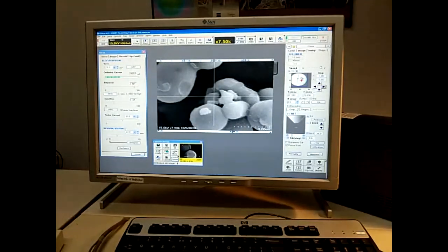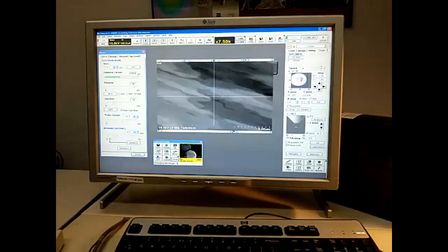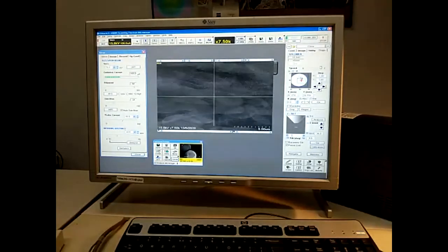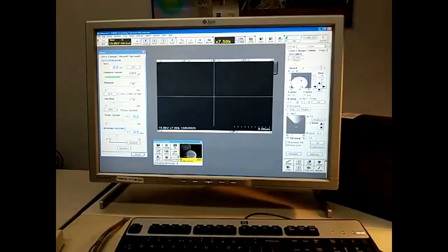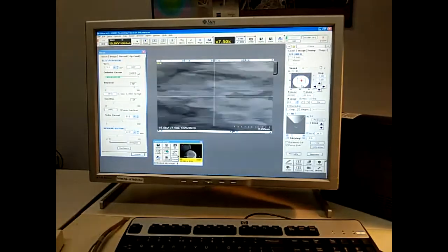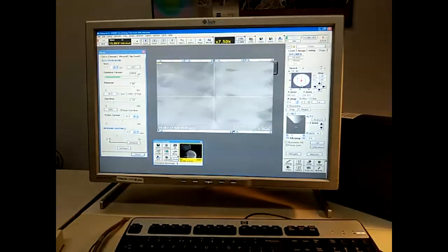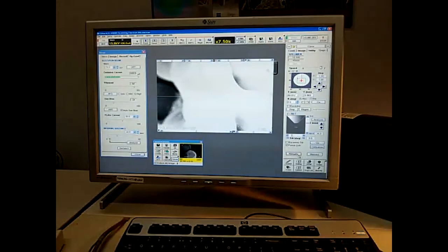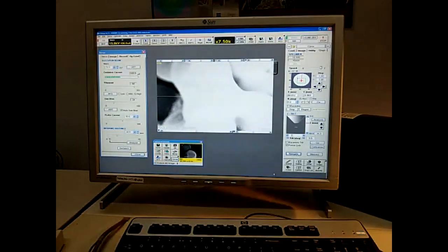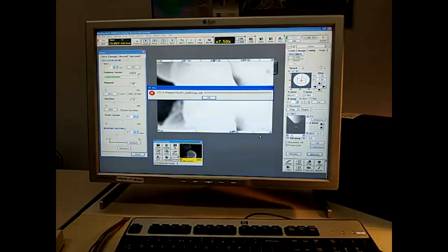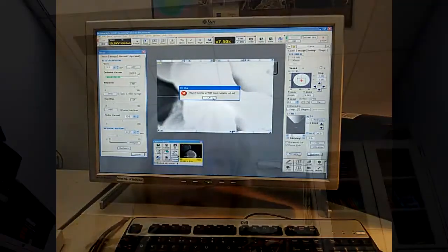And then you can also double click on the diagram here of your stage and move around in that mode. I've probably gone right off the sample now. There is a stage history setting that you can use to navigate. So you can program and get your navigation history.